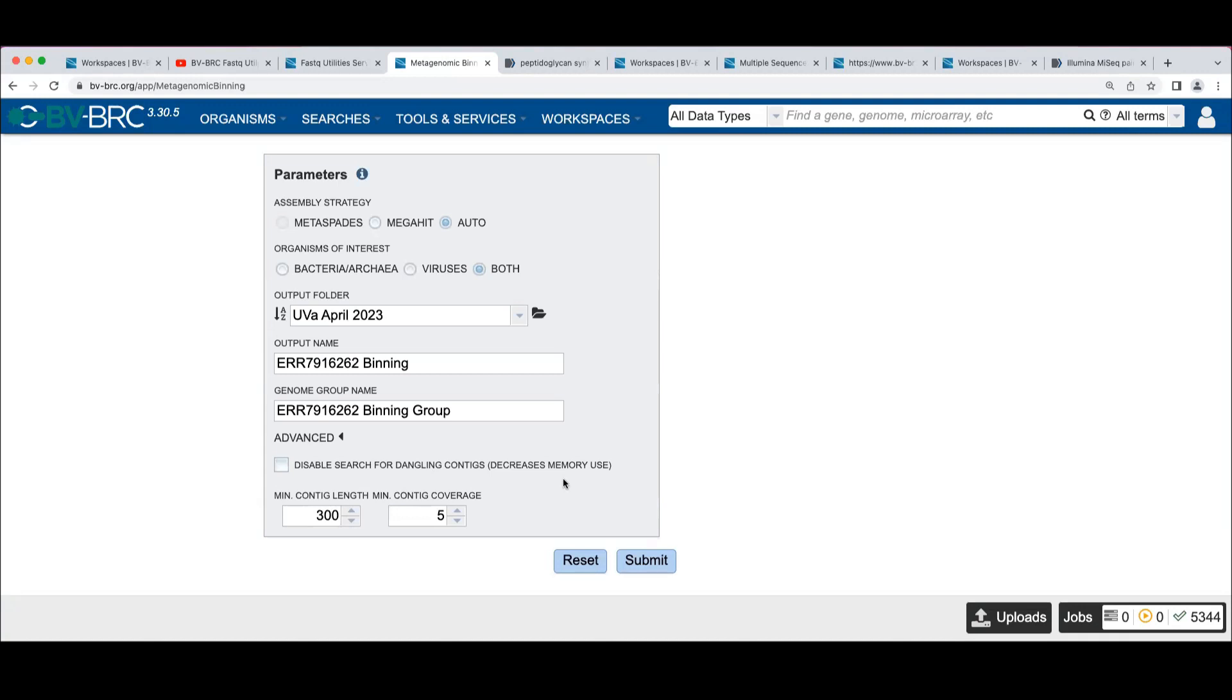If you have problems with that, you can click this checkbox and your job may get through more readily. And you can also change the minimum contig length, the minimum coverage. This is on the initial filter after the assembly to remove the short contigs from consideration.